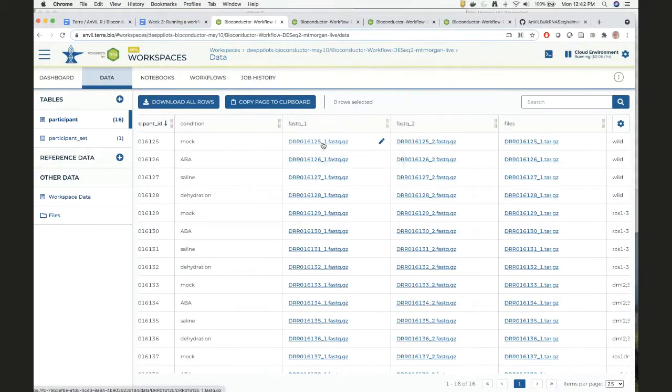Yeah. It's a little bit hard to see here, but it says GS:// and then the first number, FC-78B blah blah blah. That's the bucket identifier where it's stored, and that's determined by the workspace that you're going to store them in.